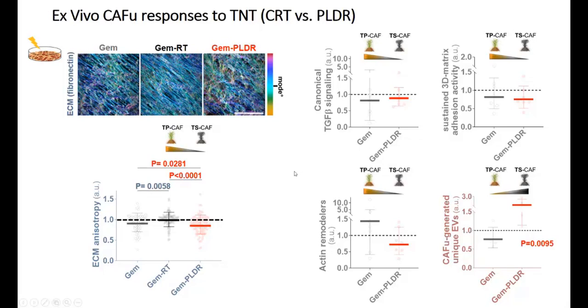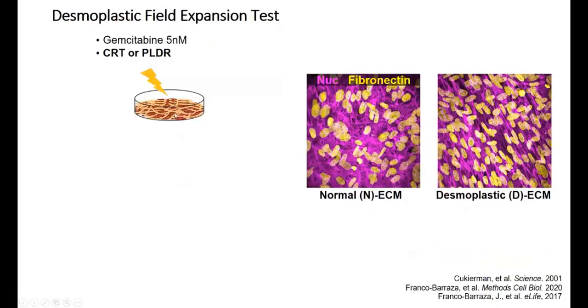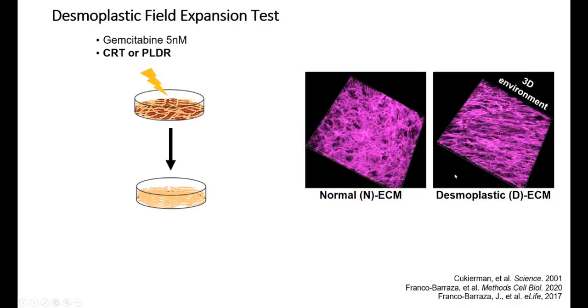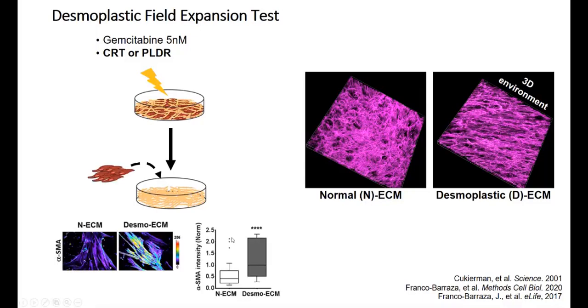Well, the next, as I mentioned, when we have these cells, we decellularize these matrices, and now we tested these scaffolds, which, by the way, as I mentioned, continue having the three-dimensionality, so we are mimicking the environments that the cells will encounter when they are seeded.